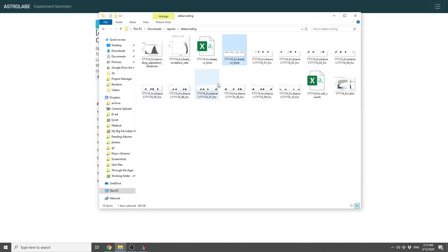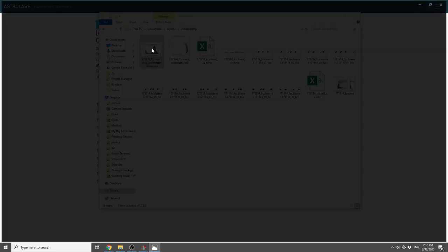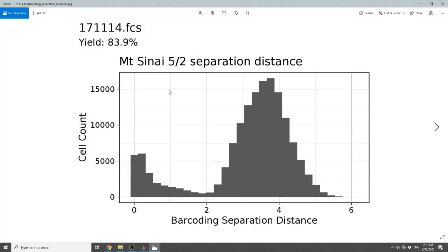And finally, Astrolabe is going to calculate the yield and the barcoding separation distance. The yield is the percent of events that have been assigned to any of the codes. In this case, these are PBMCs. The yield is about 84%, and I think that's a pretty good value that's to be expected.